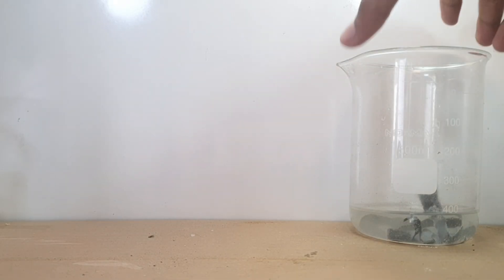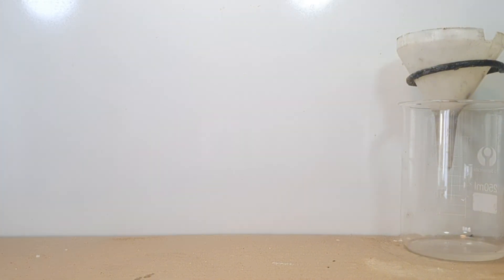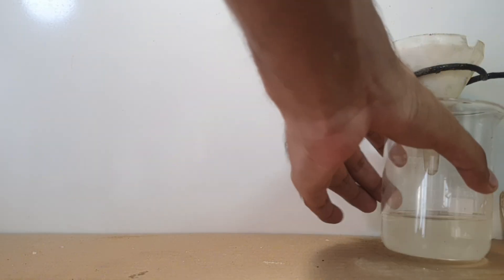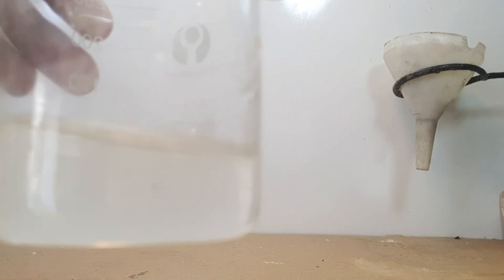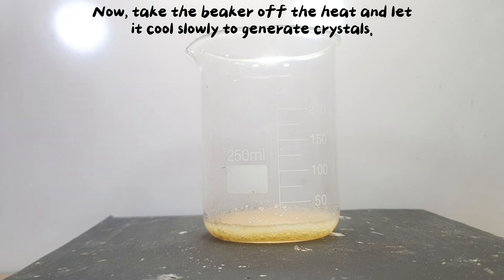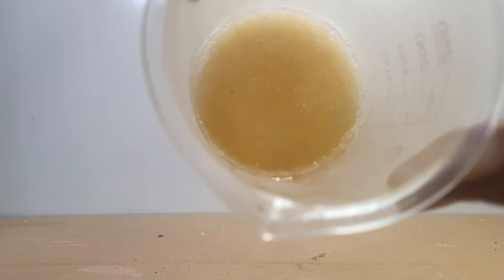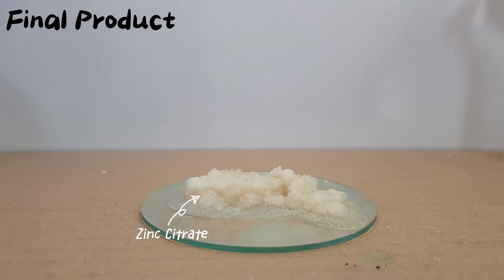Five hours later. Now heat the solution to evaporate the water until it becomes concentrated and starts forming crystals. The next day, take the beaker off the heat and let it cool slowly to generate crystals.